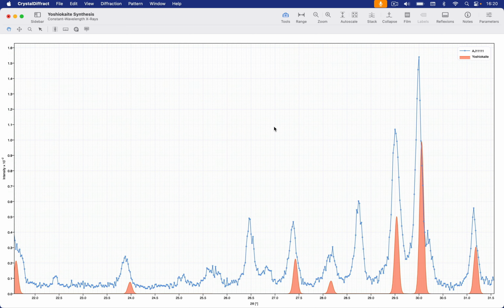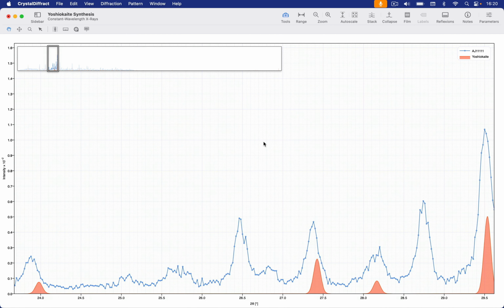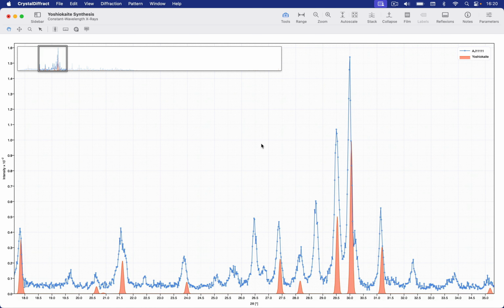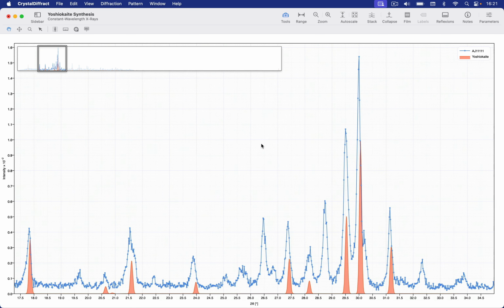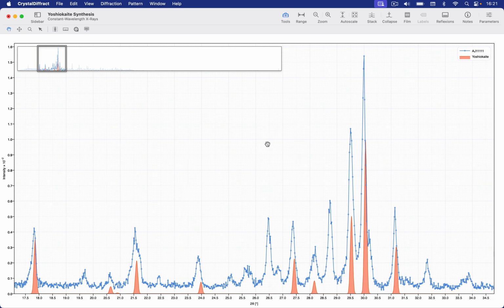Standard multi-touch pinch and expand gestures allow you to control the x-axis range, and a horizontal scroll, where we emulate a horizontal scroll wheel, comprises two fingers slid horizontally across the trackpad, and this gives you very fine x-axis positioning.